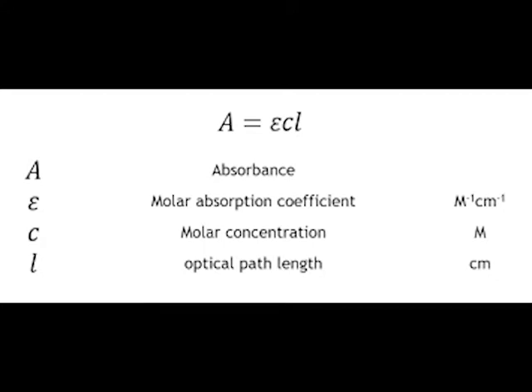L is the optical distance, which is the distance traveled in an optical system by light and is determined by the solution's container.